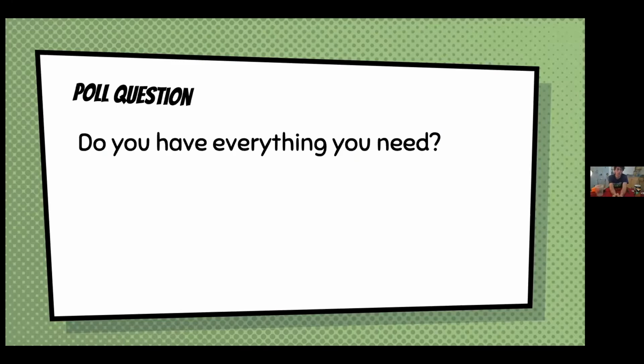We will have some more poll questions throughout the presentation to make sure that you are able to do some of the steps. So I think we'll end the poll. Seems like about 4 of you will be doing the procedure with us, which is great. That's exactly what we want. And so now Gabriela can tell us what's the first step.